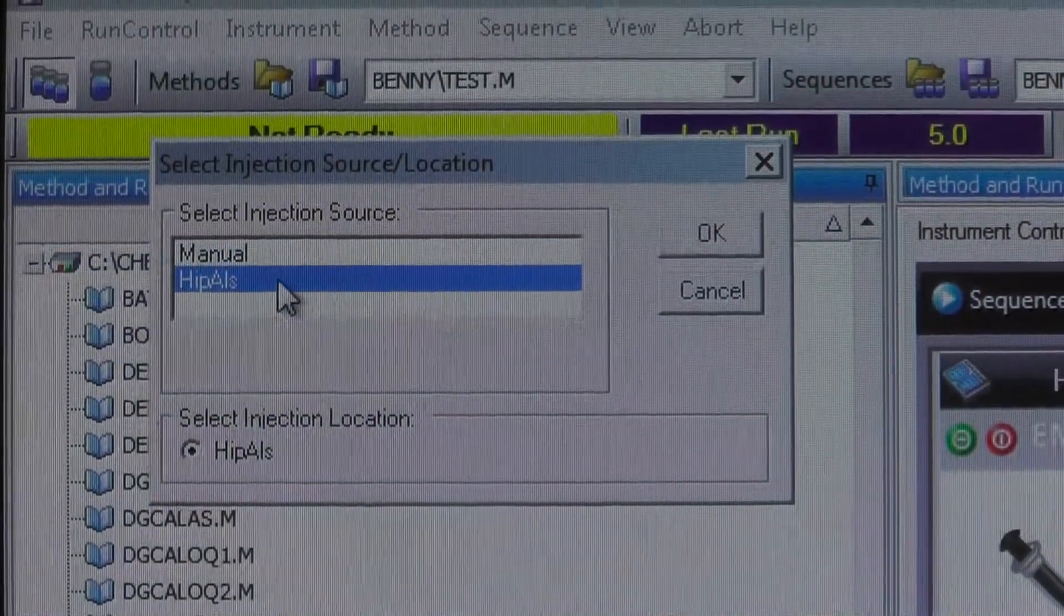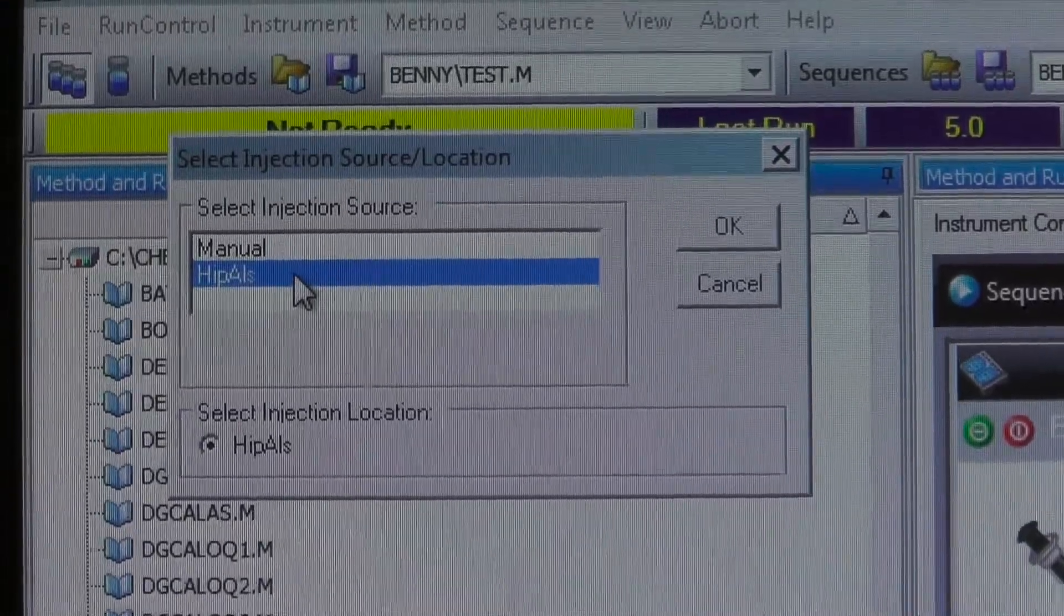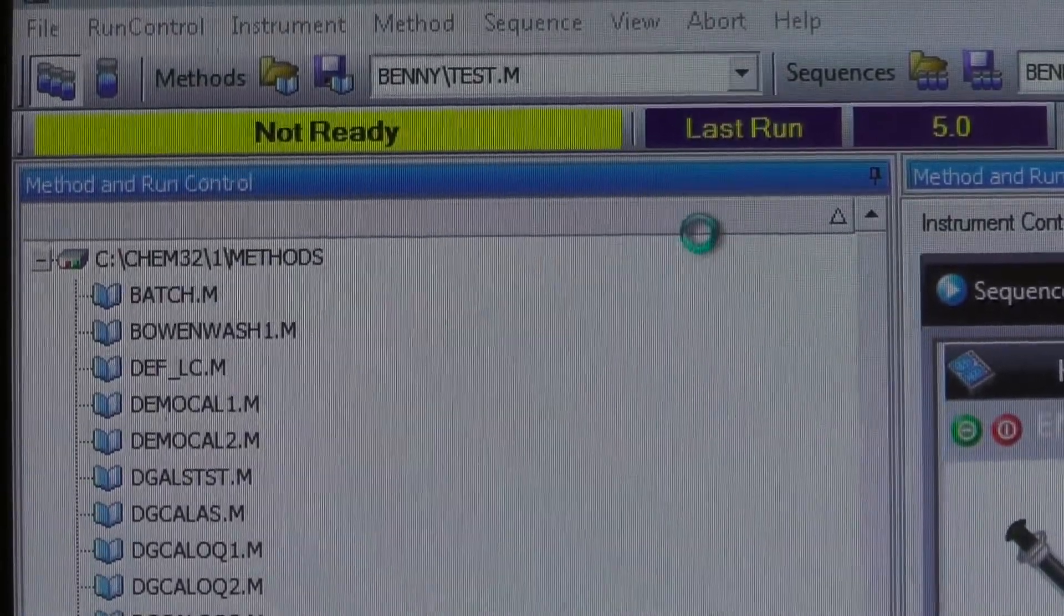A window will pop up automatically on the top left of the screen. For the HIP sampler type, always select HipALS. Click OK.